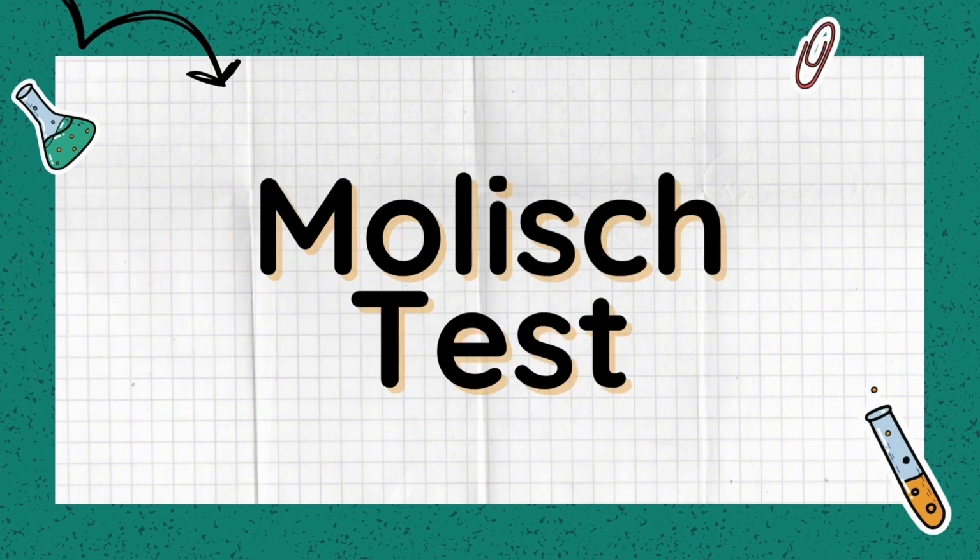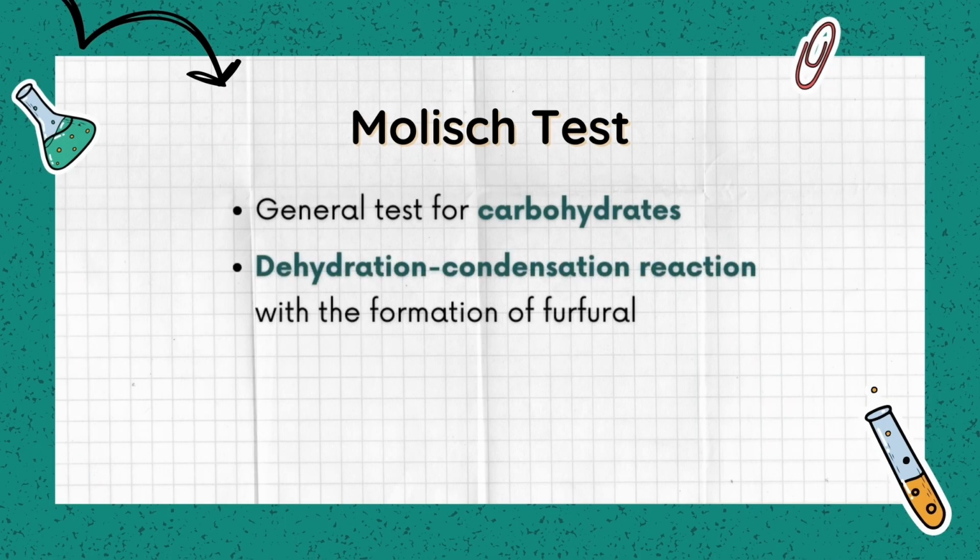First up, we have the Molisch test. This is commonly known as the general test for carbohydrates. This works by means of a condensation reaction between the alpha-naphthol in the reagent and the furfural derivative. Now you may be wondering, what even is a furfural and an alpha-naphthol, and how are they linked to one another?